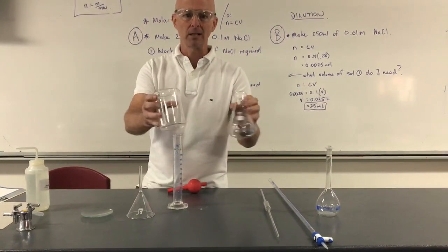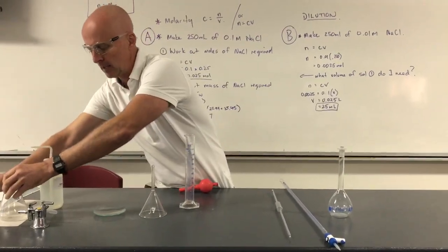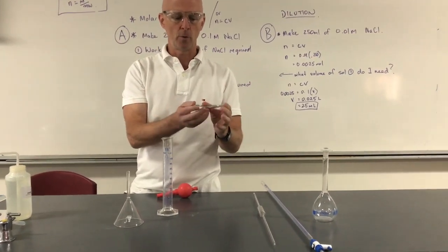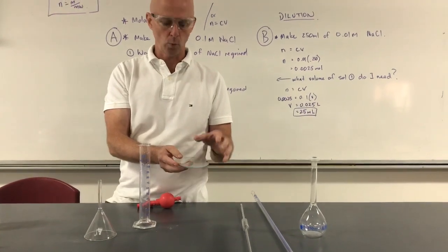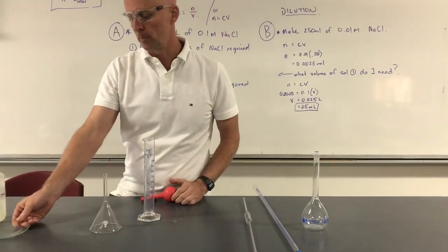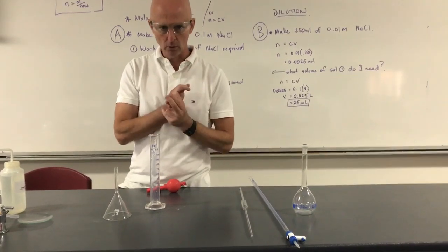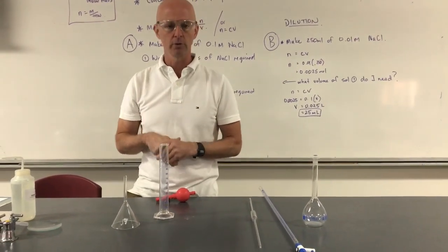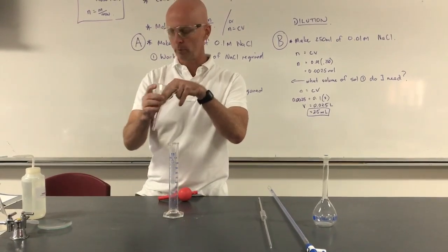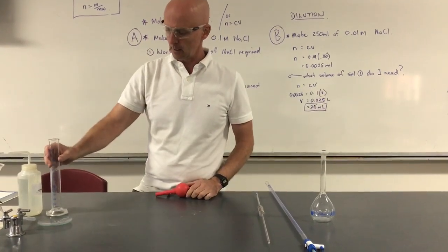So these are for mixing chemicals generally, or just generally holding chemicals. Beaker, conical flask. We have our watch glass. This is useful for putting on a scale and then weighing out solute onto that. You should be familiar with those terms, solute, solvent and solution. If you're not, look those up and make sure you get a definition in your rules section in your summaries. Filter funnel, putting filter paper in or just transferring liquids and things. So they're the basics there.